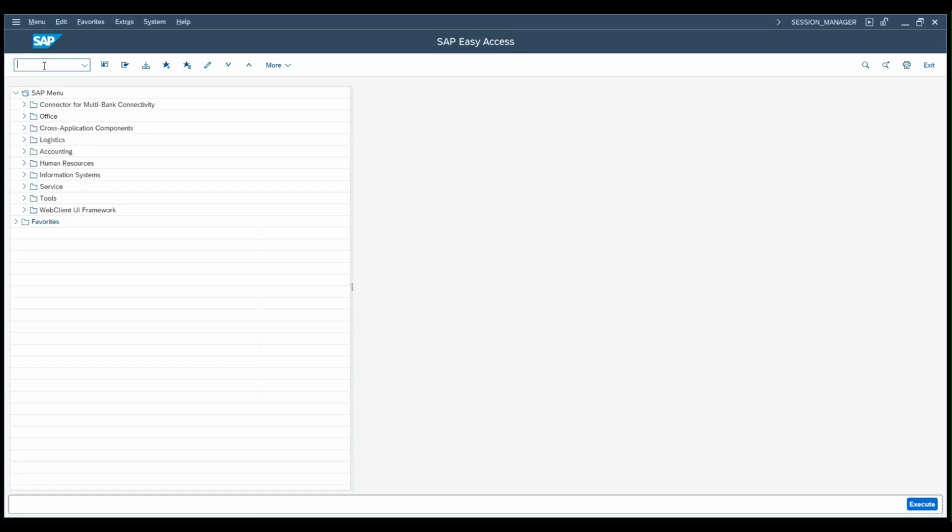You can see the specific video for that as a master data, but here we're going to be reviewing this just as a business process, okay? It's a typical process for the laboratory to create new master inspection characteristics when there is a new product, for example. Every time there is a product introduction, you might need to be creating new characteristics if they're not already defined. There are different approaches to create this, but let me just start in SAP QS21.